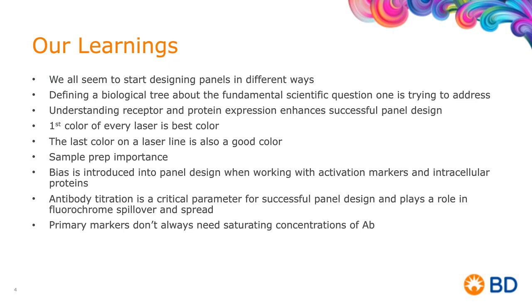Well, it goes without saying that sample prep is everything, and the choice of the protocols that we use, the age of the sample that we have, whether it's isolated PBMCs, if it's blood, or if the cells come from lavage, all of that is under your control. And we all know that the greatest flow comes from a great sample. So that's one thing that really is out of our control a little bit in some ways for collaborations, but in many other ways we have full control over that. So our dedication to our protocols is critically important.